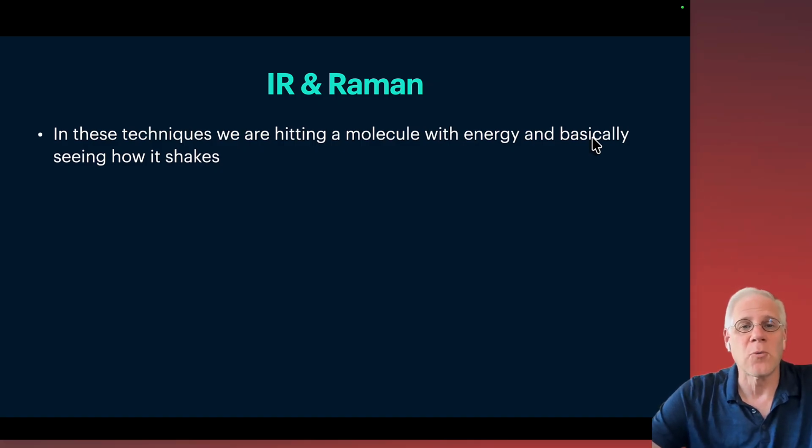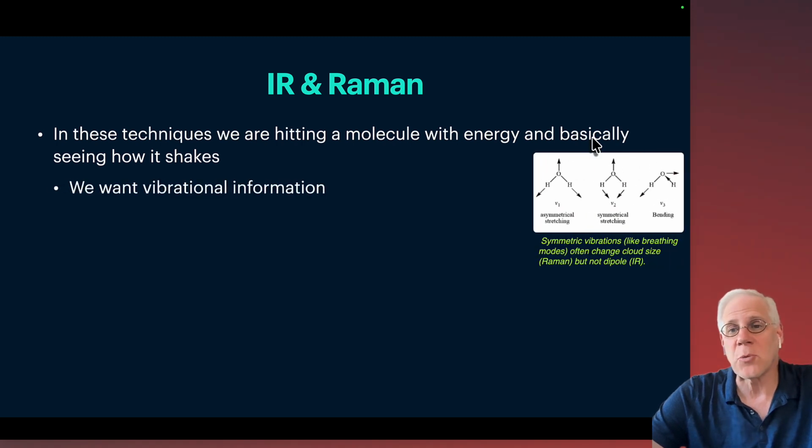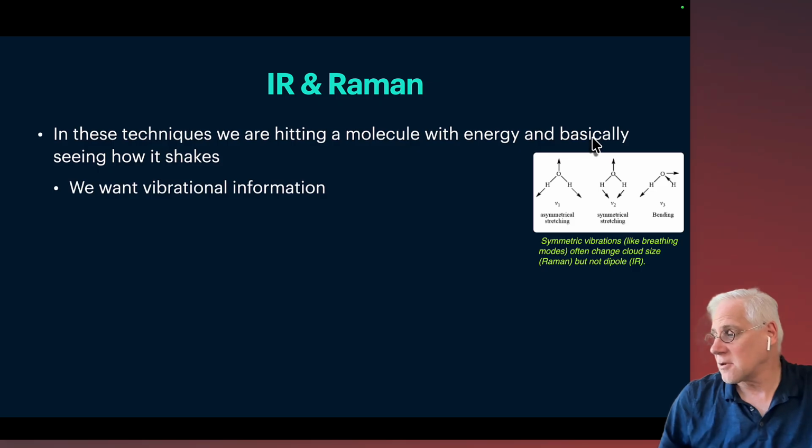In both of them, we're hitting a molecule with energy, generally in the infrared or near infrared, and we're essentially looking at how it shakes. We're looking at vibrations of the molecule. And that's what we want. We want vibrational information.